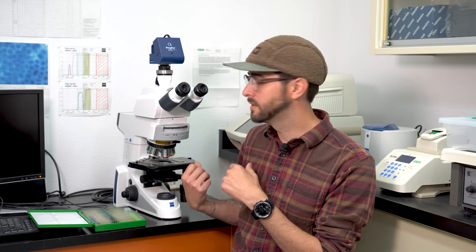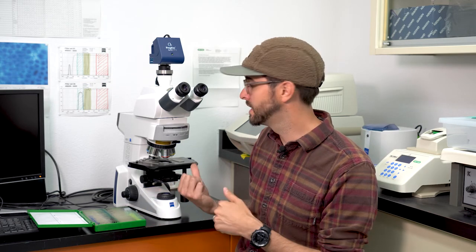Now that we have our thrips specimens mounted on microscope slides, we can take a look at them using this compound microscope, which gives us a much higher magnification so we can see all those fine details on the body structure that we need to identify them to species. Let's take a look at a few characters that'll show us why thrips are such damaging pests on peonies.